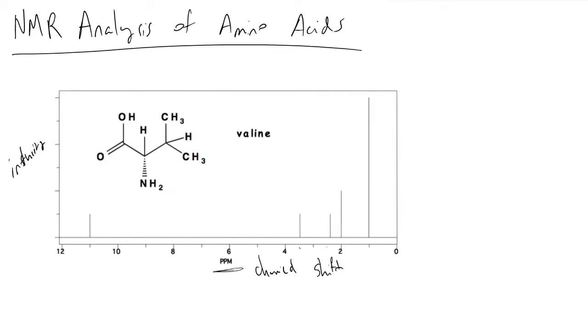But commonly, you'll see peaks that look much broader, and they'll have actual areas. These areas will tell us what number of protons we're dealing with by normalizing these peak areas to the total area of the peaks of interest. The first thing I like to do in analyzing a spectra is label the peaks. Working backwards, or downfield, I'll call these peaks A, B, C, D, and E.